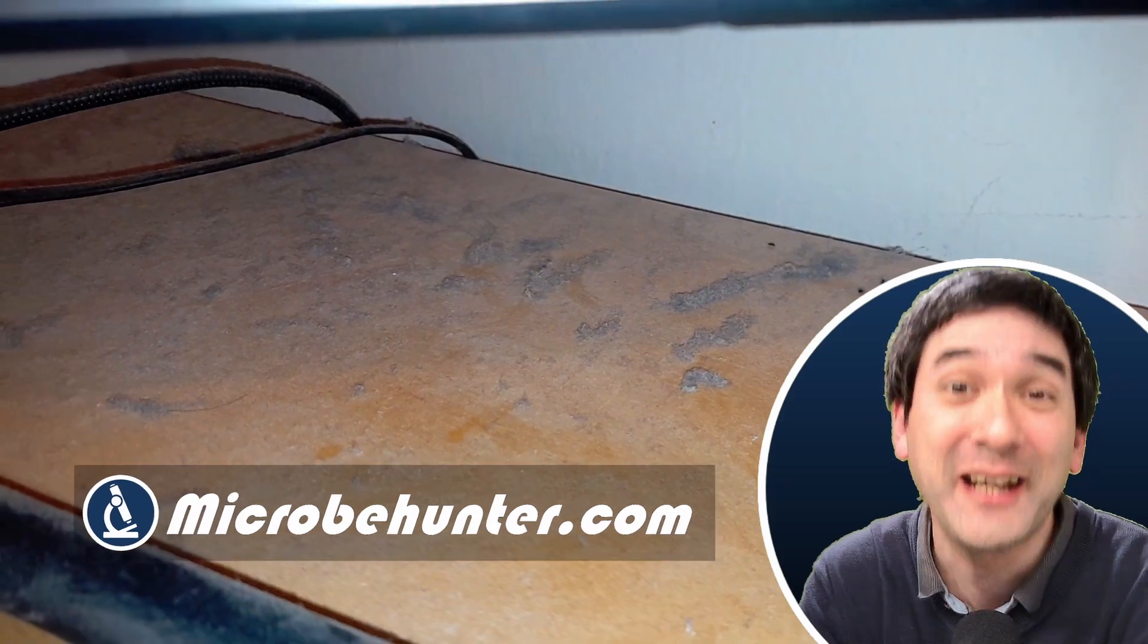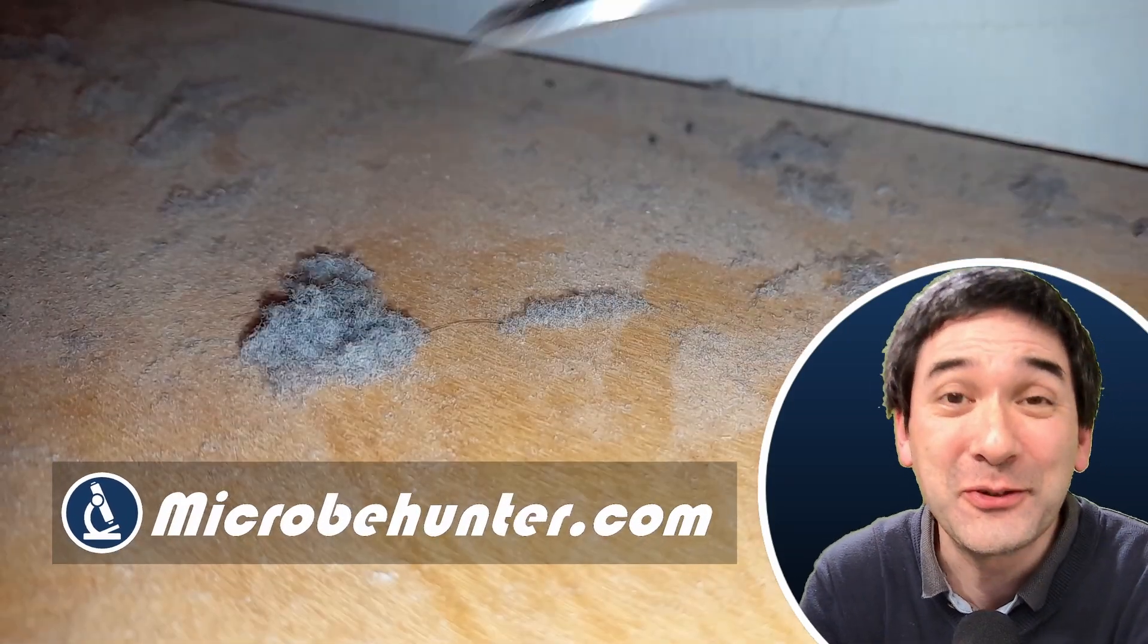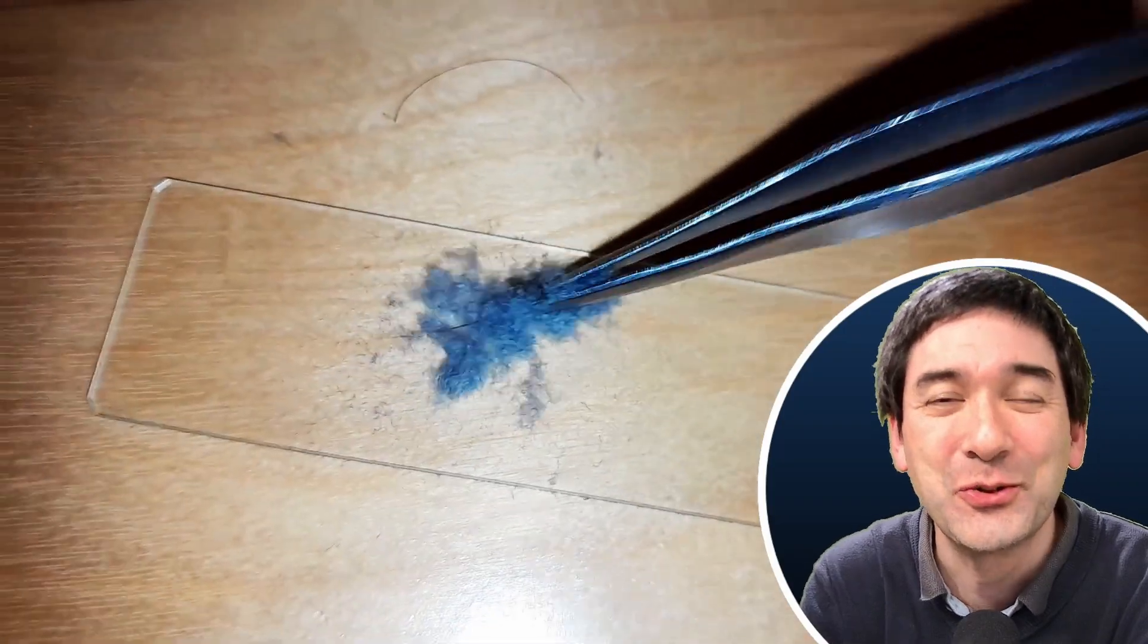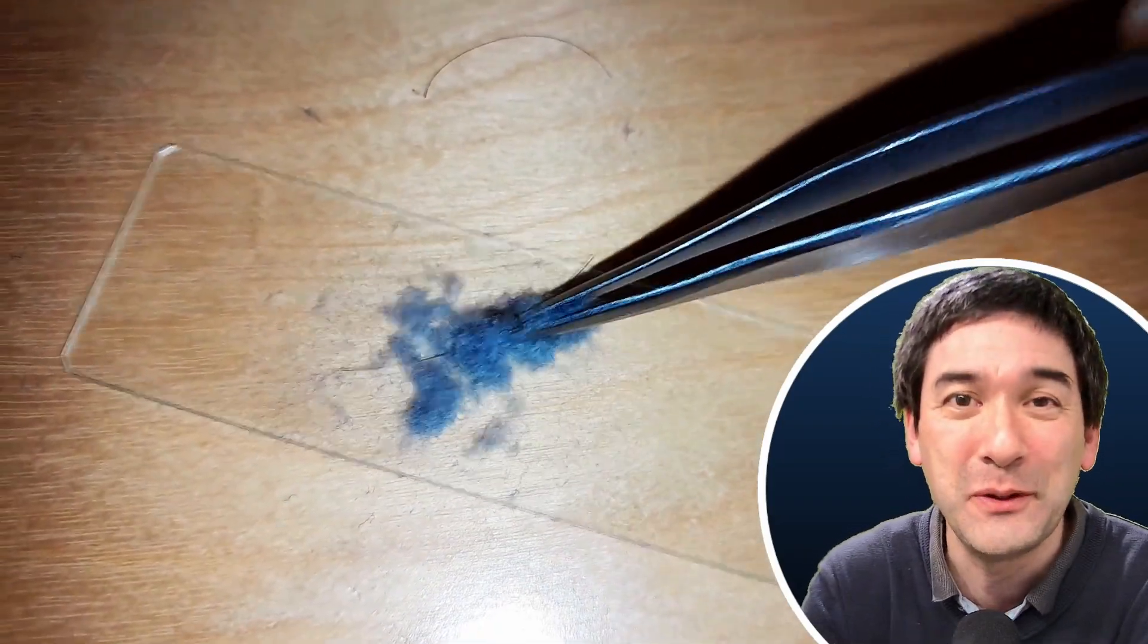Hi, hello and welcome. Microbe Hunter here. I like to put things under the microscope. And today, it's this not so appetizing, not so nice looking dust that I found behind my computer monitor.